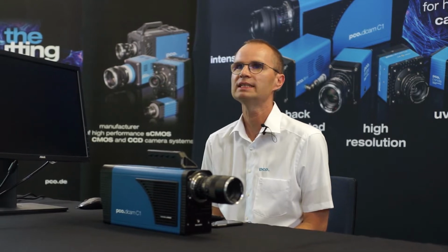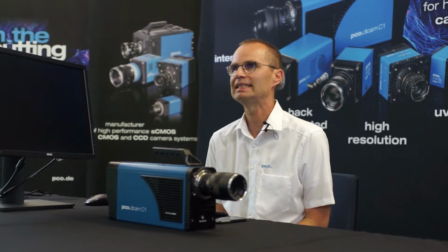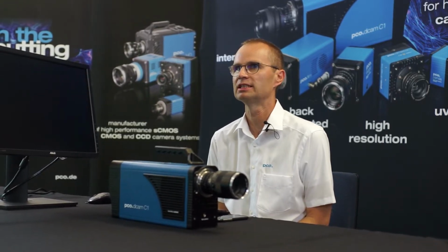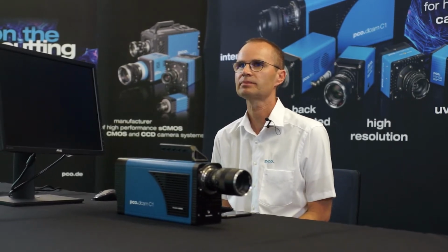Welcome to this introduction to intensified imaging. How to extract valuable information out of just a few emitted photons? Historically, image intensification based on intensifier tubes was the only way. Presently, this is no longer the case. When there are few photons to capture, electron multiplication CCD and, more recently, scientific CMOS have become the methods of choice. These newer technologies come with some advantages, ranging from image quality and resolution to easy handling.